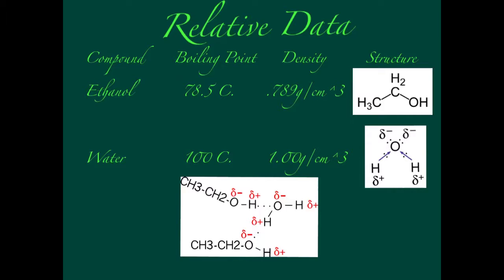We can kind of predict already that when mixed with water, both compounds will have strong intermolecular interactions due to the electronegativity of the oxygen atom and the hydrogen substituents. Let's keep this in mind for when we attempt to separate them by distillation. And you can see here the attraction between the hydrogen proton and the oxygen ion.